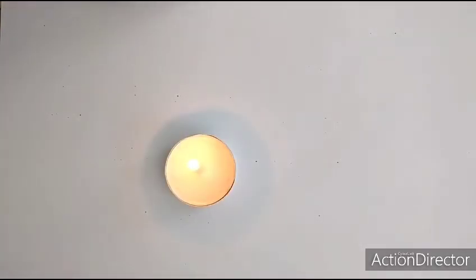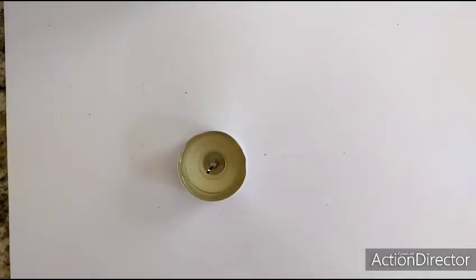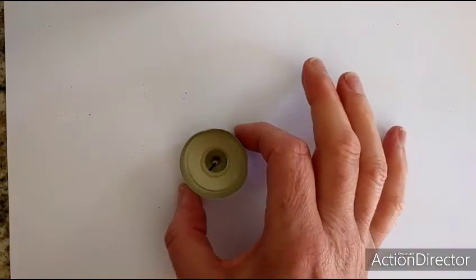All right, so our tea light is lit, and I am going to let that go for 1 hour, and then we'll come back and we'll take the mass and then talk about the calculations. Okay, we're back, and it's been an hour, so I'm going to blow out the light. So now we have a lot of melted wax that's in the tea light holder, but that has not combusted. That's still part of the mass. So we're going to go ahead and take our mass now.